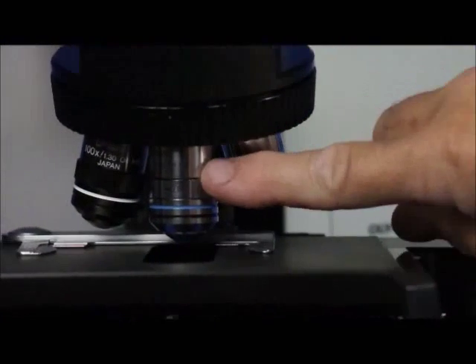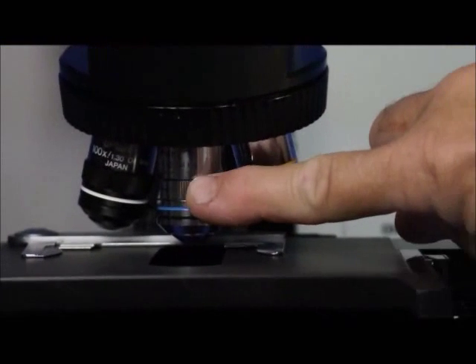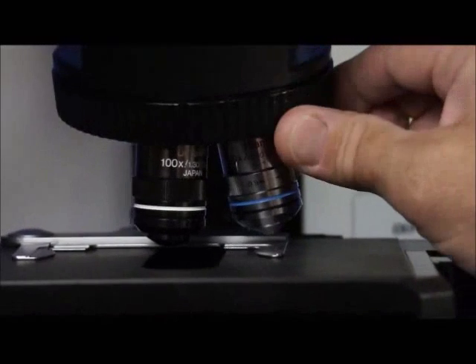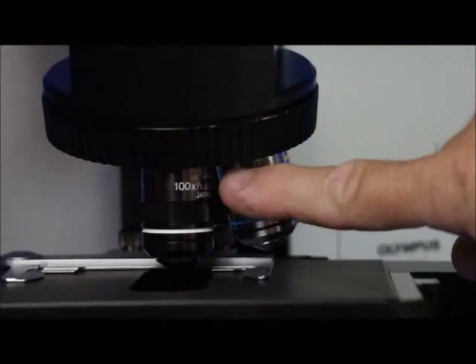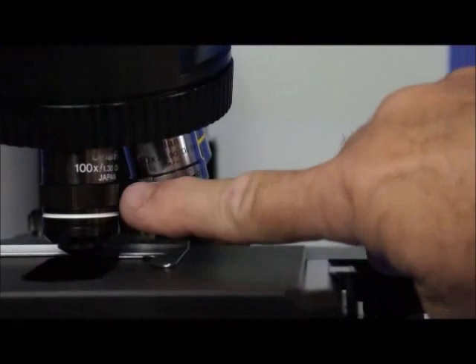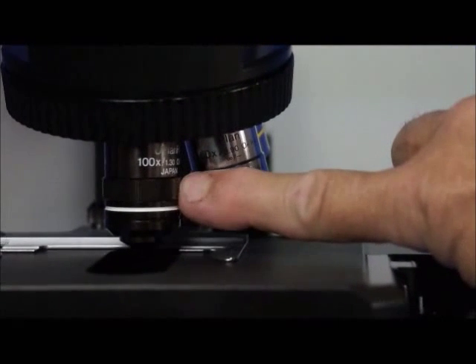The next one over is a 50 oil objective lens, which has an iris diaphragm. And the third one is a U-plan fluorite 100x objective lens, also with an iris diaphragm.